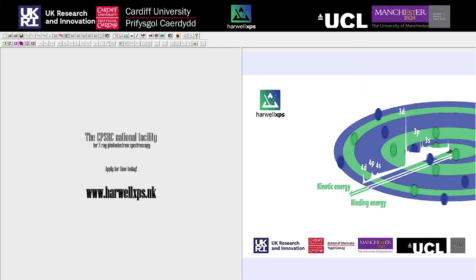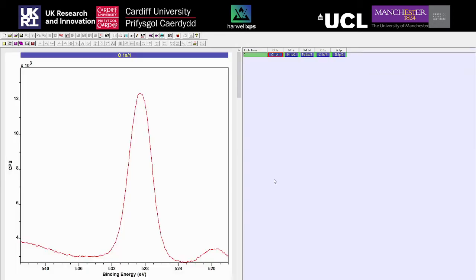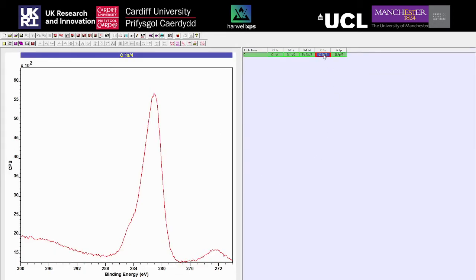We're going to move over to CASA now. I'm going to open up a couple of examples - the first one is a simple carbon overlay. Carbon is something we would typically look to calibrate to. There's a lot of controversy around calibration and what's best to calibrate to, however it's still generally recommended to start off looking at carbon. As long as you report what you calibrate to and the energies, this goes some way to explaining your process.